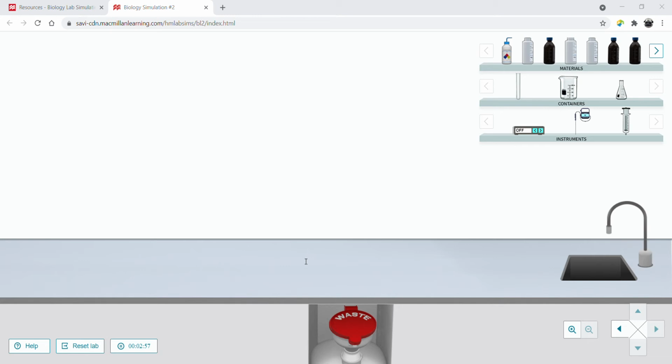So for your negative control for all 4 of these tests, you're going to run the test on just water, because if it turns positive in plain water, you know that there's something wrong with the reagent. Maybe somebody didn't clean the glassware from the previous class and there's residue on it. But the main purpose is to be sure that you see what a negative result looks like.